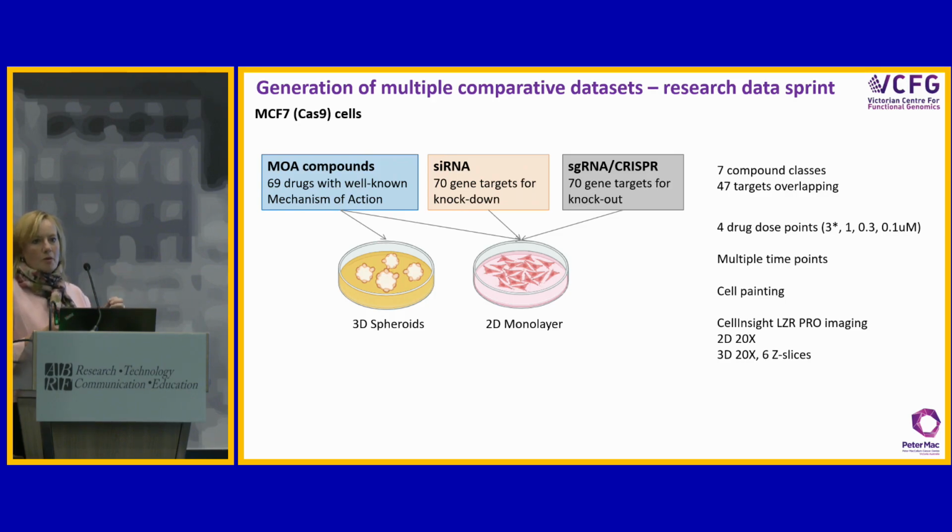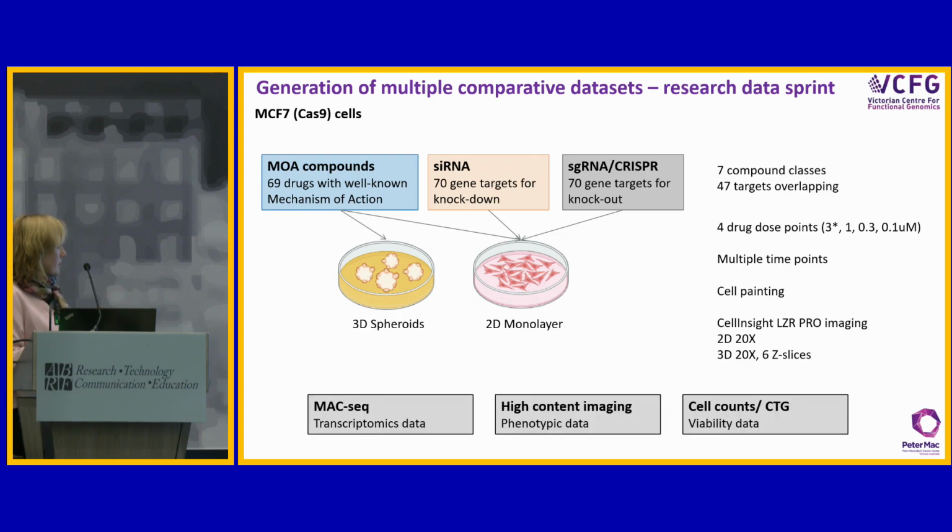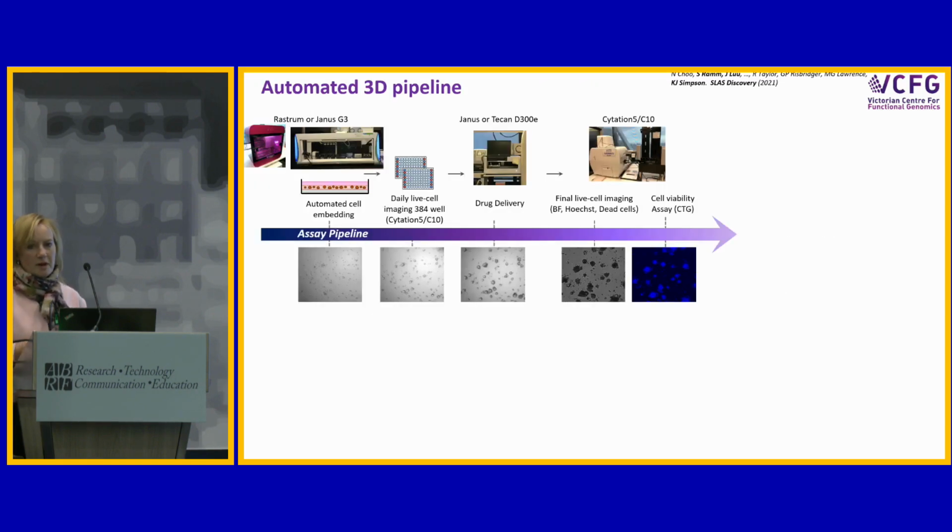And now we're using this as our data set to start to understand the nuances around developing a pipeline for transcriptional profiling, developing a way to integrate the image outcomes, and whether or not truly there will be any representation across one modality to the other. So it's a work in progress right now, the transcript data, the phenotypic data, and then the cell viability data as well.